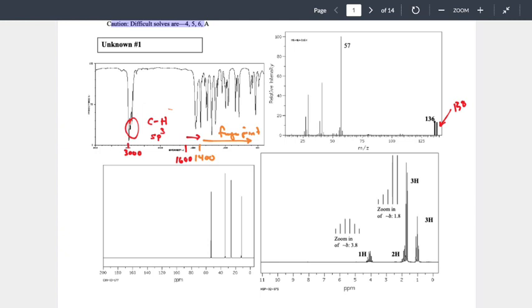Those 4 pieces of information need to get analyzed somewhat independent of each other, or I would recommend being somewhat independent of each other, and it scales in difficulty significantly. Being able to interpret your number of signals, pretty easy. Being able to interpret the amount of times your signal breaks apart, that now gets much more challenging, and can lead to confusion. So start simple and work your way up.